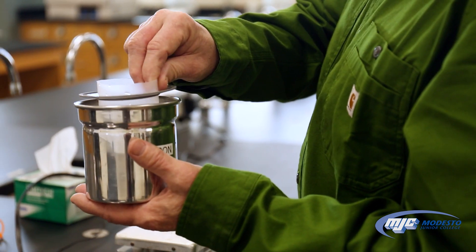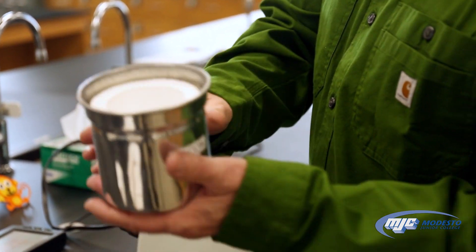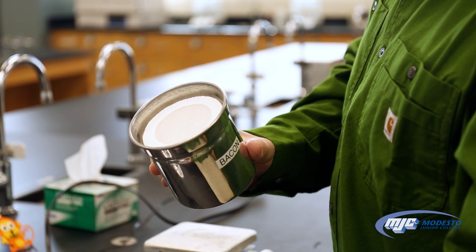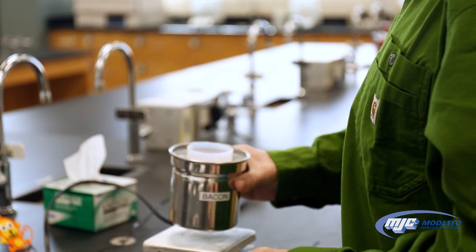The calorimeter itself has a cup that comes out, and inside there's a styrofoam insulator that usually just stays in. You can take the cup out if you need to weigh something into there or measure something into there.